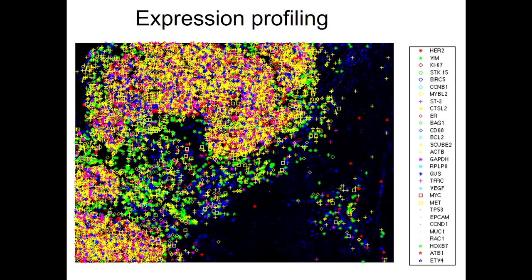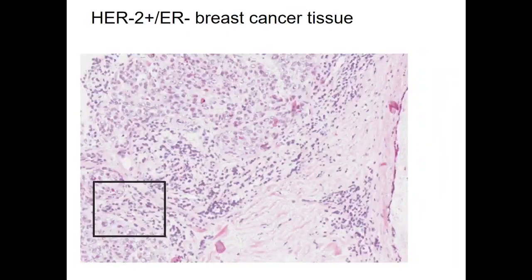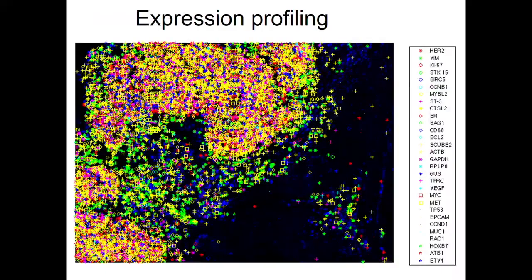And then we plot symbols, and you can see that the combination of colors and symbols are really different in different areas of this tissue. And there is a prominent yellow-pinkish area here, and then a green-bluish area here, which translates to the cancer cell compartment and the surrounding stroma. This is an H&E stained. Well, after the sequencing, we stained the tissue with the H&E, so it's the very same tissue that we have now, the morphology and the molecular content.